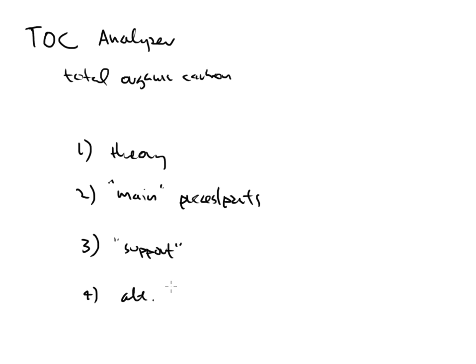All right, so here's the breakdown of what we're going to be talking about. There's also a chance that you've used a TOC already. Maybe you've used the TOC in a different class. Maybe you've used the TOC at a place that you're currently working. I mean, who knows? Some of our students do come from a working laboratory facility right now.